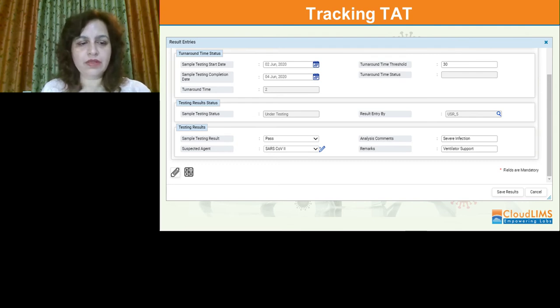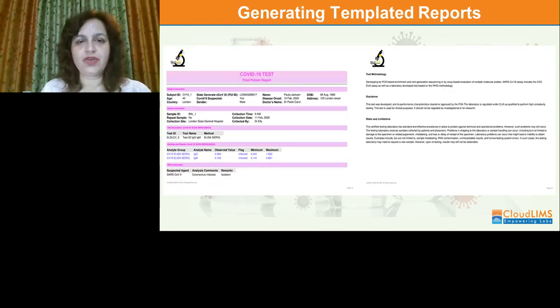One of the primary requirements of a diagnostic lab is generating reports. So a LIMS allows laboratories to easily report the test results. Using a LIMS, a lab can design multiple reporting templates and meet reporting requirements easily. You can add graphs, flags, your logos, signatures. You can insert comments on the observations and report and meet the reporting guidelines set by the government bodies such as FDA and CDC if you're in the US. Here is a report displaying results from a quantitative ELISA test.